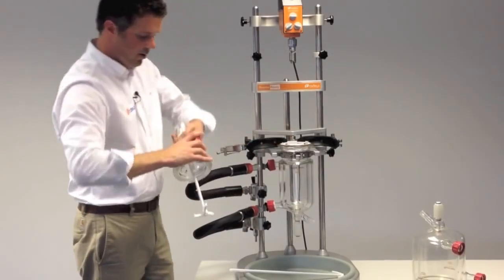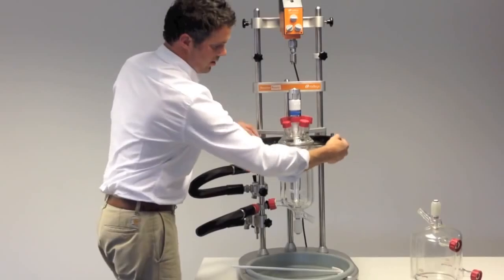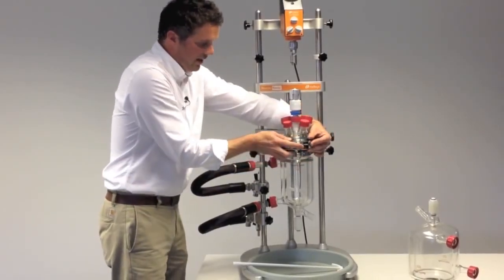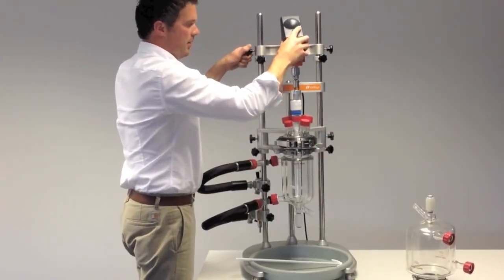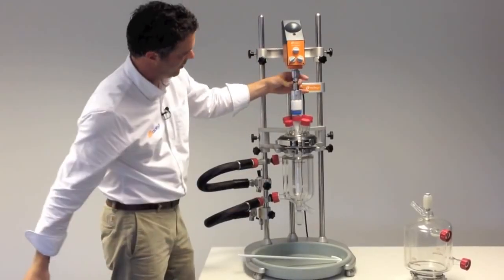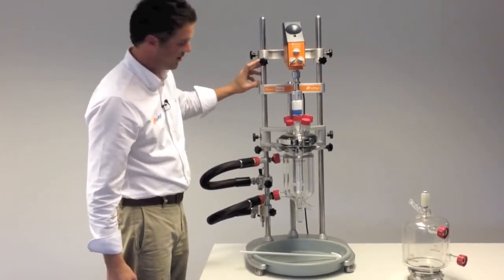The o-ring support collar. The quick release clamp just brings that all together and gives a good seal. Then we can drop the stirrer motor back down and you can see that everything's lined back up and it's just dropped back down to the support collars on the framework.